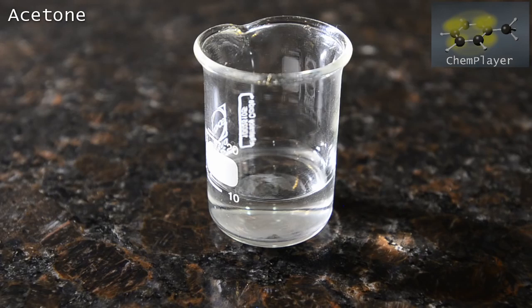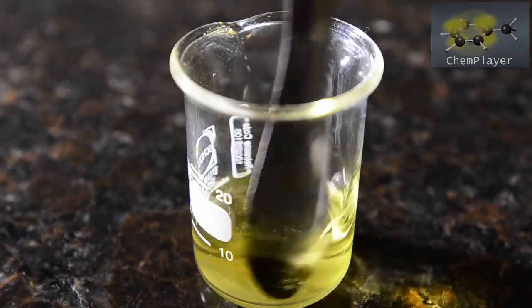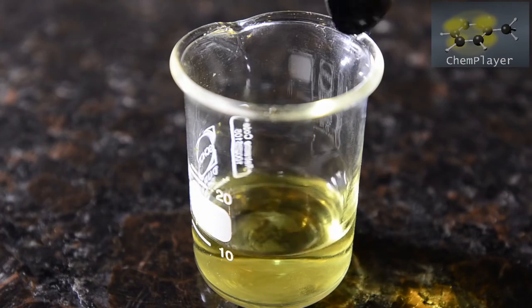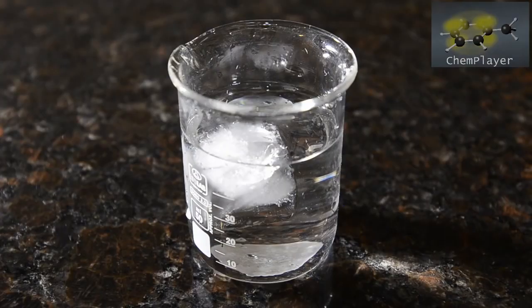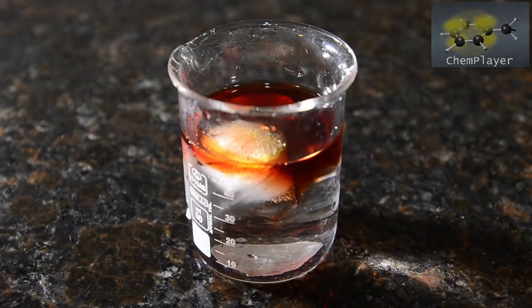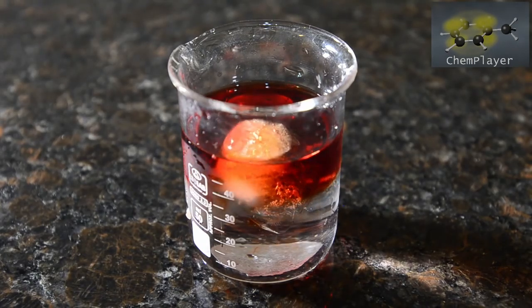Here's a little acetone in a small beaker. We dissolve a little of our product in it, and it forms a nice yellow solution. Now here's some ice water. Let's add the acetone solution of the product. No yellow precipitate, but an intense red-colored solution again.